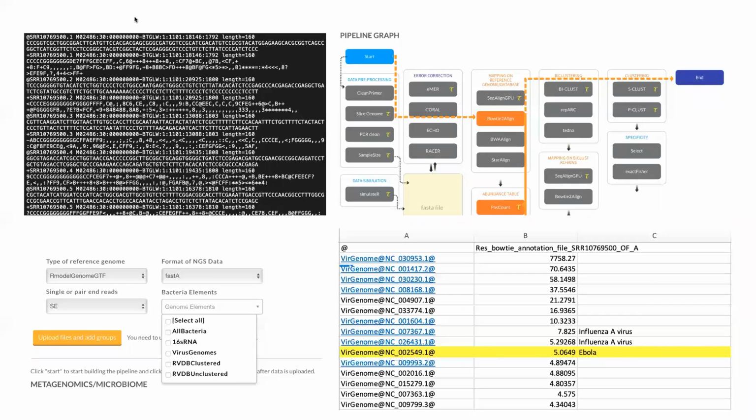And so that file looks like this. So you can see the sequence read archive name right here, and you can see those short reads, their sequence, as well as the quality of that read. So we took this file, it's a pretty big file, hundreds of megabytes, and then we uploaded that file and used it to map on the virus genome.